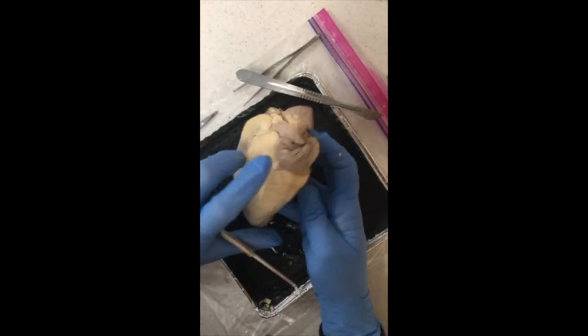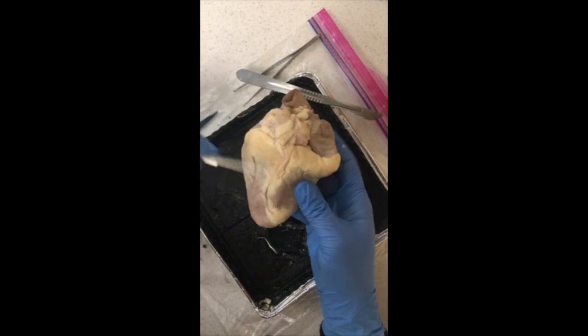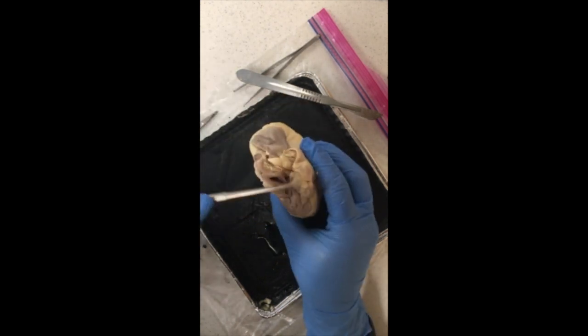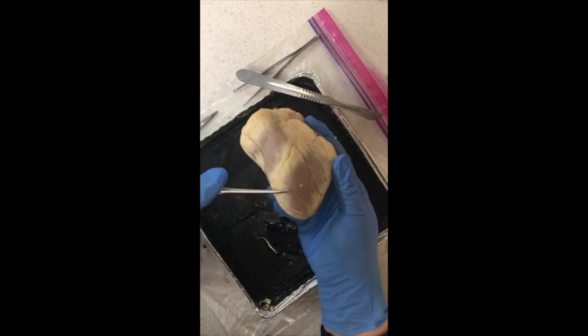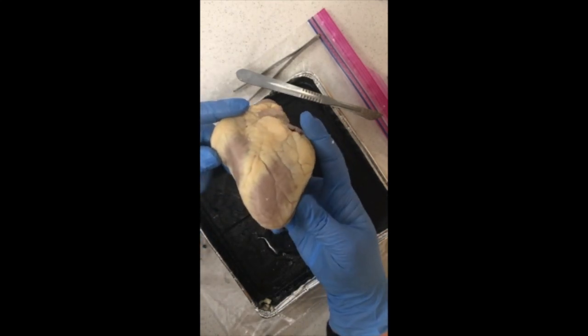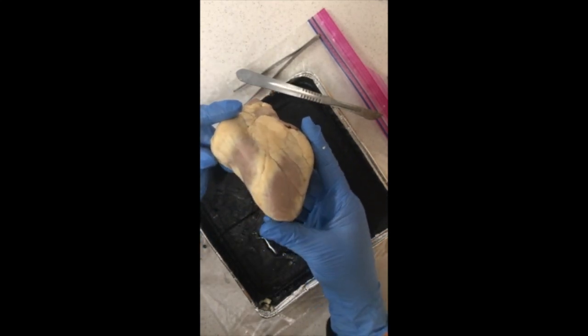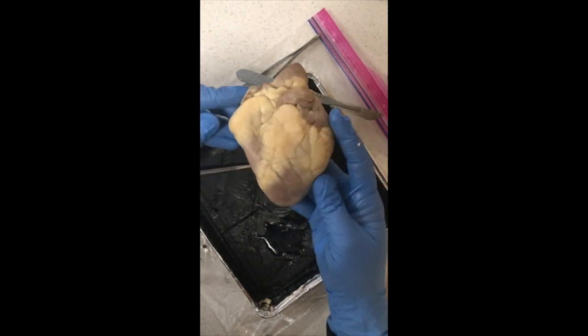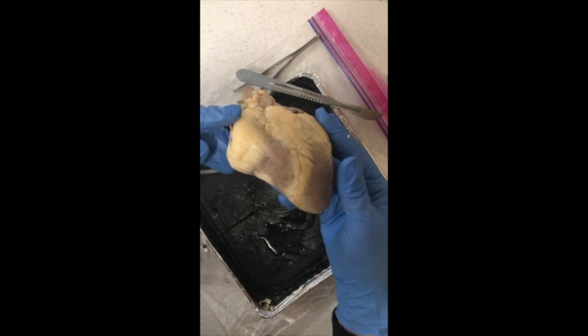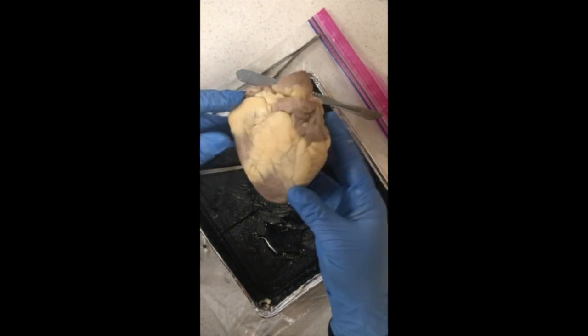Portion of the sheep heart: the posterior section, the base where the blood vessels are entering and exiting, and the apex, which is this pointed section of the heart, also the side of the left ventricle. The heart is not so much straight on, but more positioned off to the side. You'll notice here a couple of different structures.